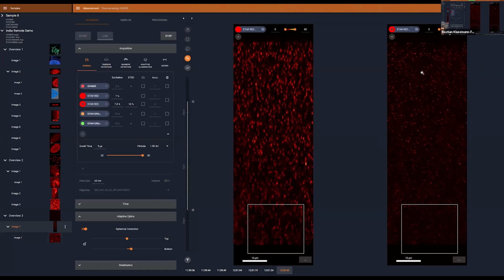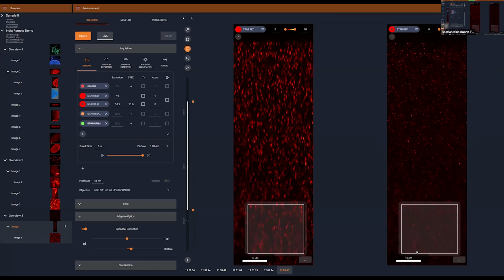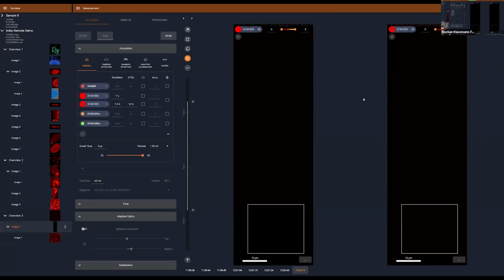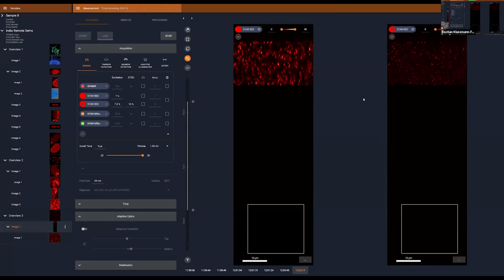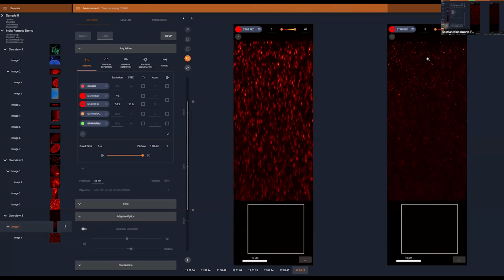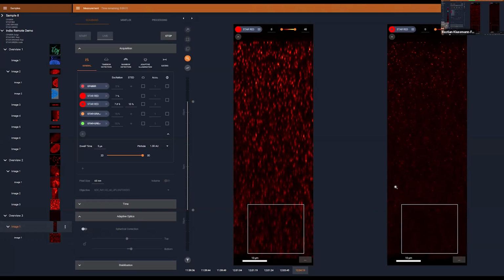So the deformable mirror, which we use for aberration correction, is basically correcting each individual area of the image here in a dynamic fashion. And as I also mentioned, it's highly reproducible. So if you know your sample, so you already have a relatively good estimation of a good starting value for your sample. And I have now switched off the correction again, and you see that the image quality degrades quite significantly if you go to deeper sample areas here.